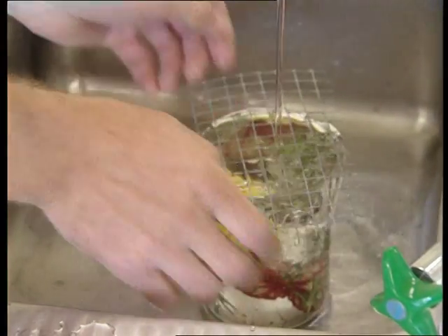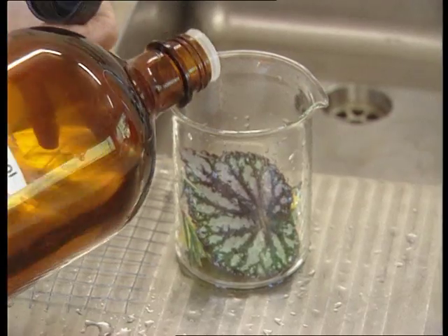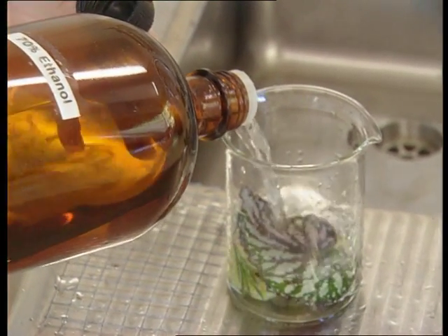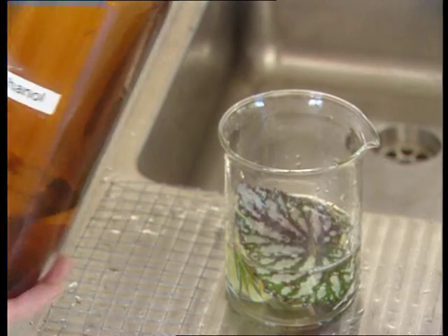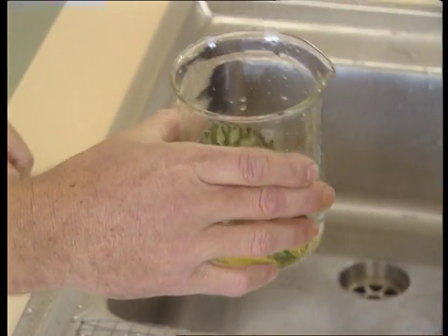The plant material is then rinsed in 70% alcohol for 10 to 30 seconds. Alcohol not only kills many microorganisms residing on the surface of the leaves or buds, it also acts as a surfactant.